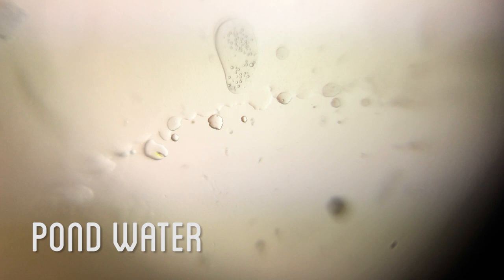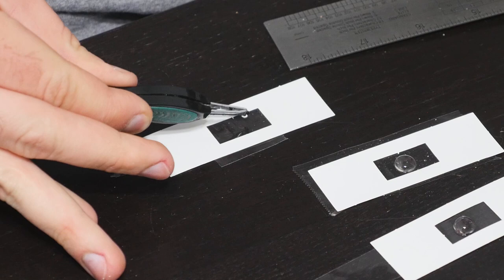As far as I could tell I wasn't seeing any microorganisms, but in the pond water I found a dead mosquito. Putting him under the lens, I found what I assume are Pyramisium that came along with him. The mosquito itself was pretty amazing to see close-up as well.